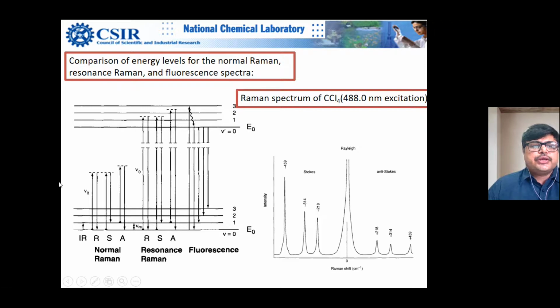Normally, we talk about an electron going from the valence band, or HOMO in this case, to the LUMO, or valence band to conduction band, and then the excited electron would like to come back after some time, and then it emits a relatively lower energy photon most of the time. But there are reverse cases also, which is seen in phosphor materials, that you can get a photon of higher energy also, even in photoluminescence.